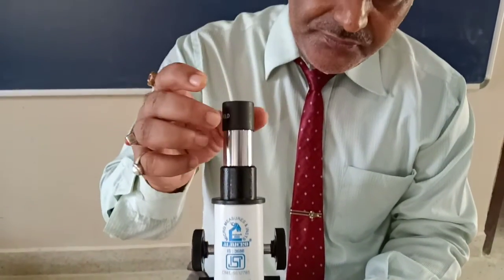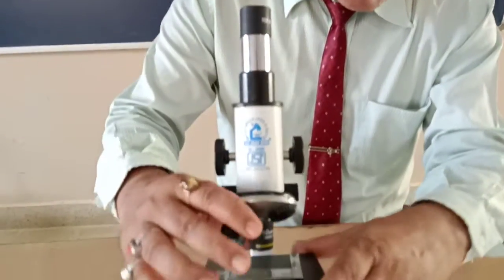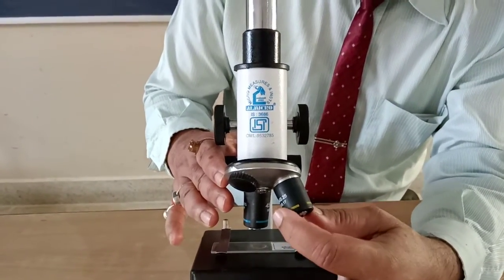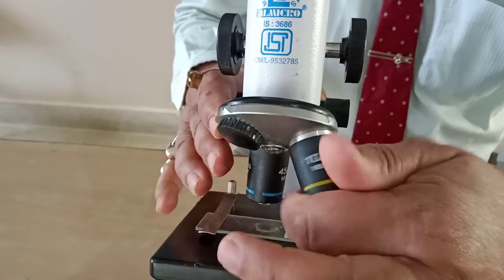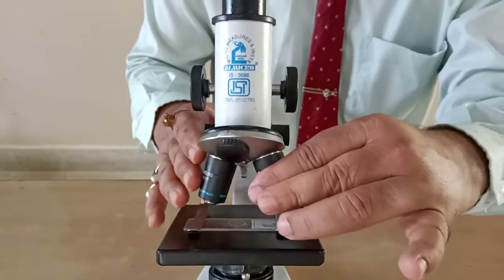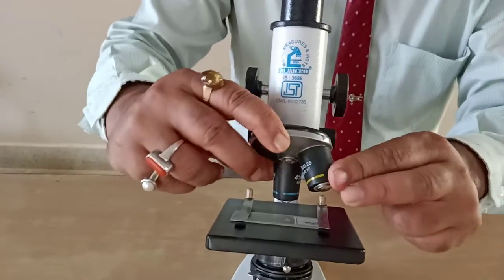This lens is detachable. We can detach this one. This is the nose piece having the lens, and this can also be detached. Suppose now I wish to detach this one and fit 60x. This is the 45x. This is 10x. So I want to replace 10x by 20x. We can remove this one, and in place of this a 20x lens can be fitted. There are 3 points in the nose piece for setting the objective lenses. Maximum 3 can be set.